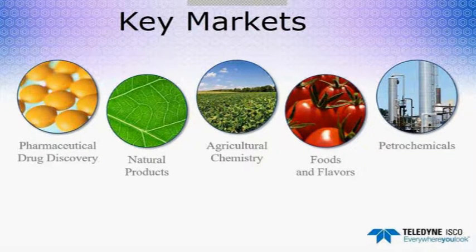Which column do you recommend to purify very polar compounds such as imidazolium salt and what solvent? My very first guess on that one is I would try either the silica. I'd start off with silica because those are usually lying around everyone's lab. And again, not every silica is amenable to aqueous normal phase, but I've tested our RediSep RF Gold silica, and it doesn't bleed silica. I would start off with the silica gel, and I would start off with, say, water methanol or water acetonitrile. And if I need a modifier, I would go acidic. After that, my next choice would be the Diol column.